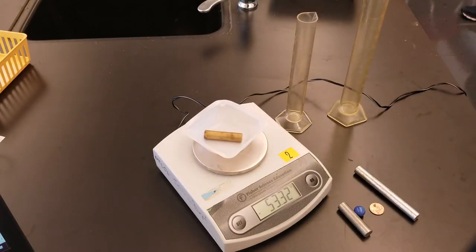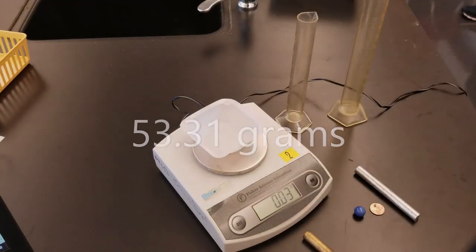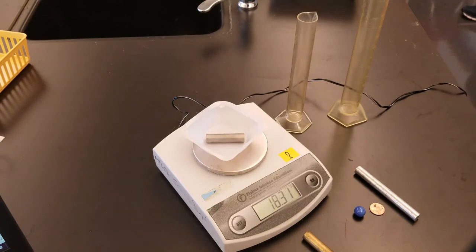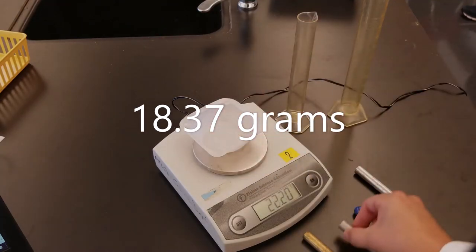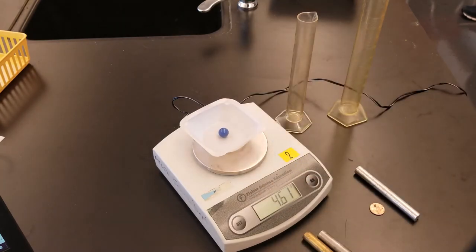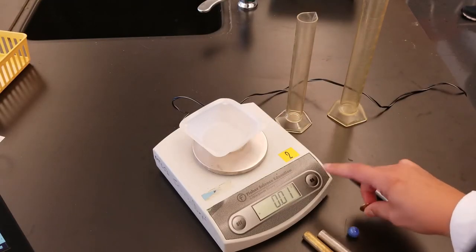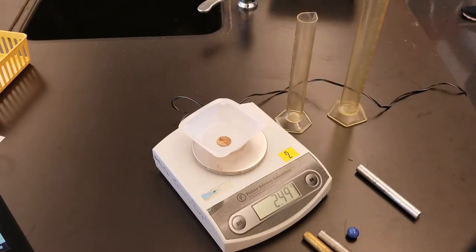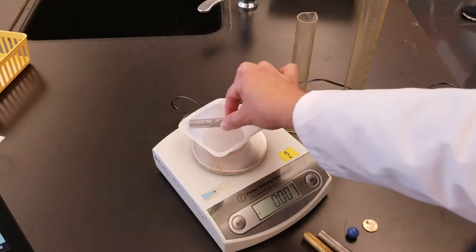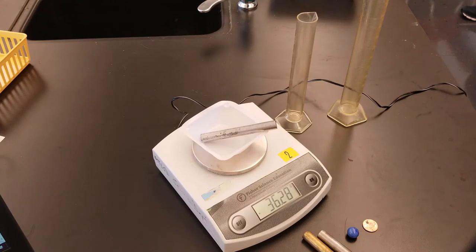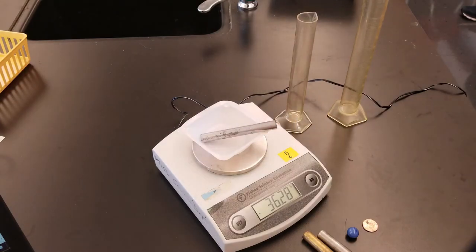Here is the mass of the gold colored five centimeter rod. Here is the mass of the silver colored five centimeter rod. The mass of the marble. Mass of the penny. And finally the mass of the ten centimeter silver colored rod. Double check that you have recorded all five of these values.